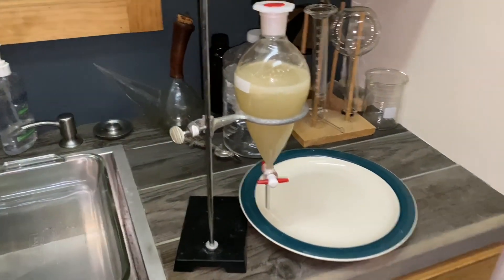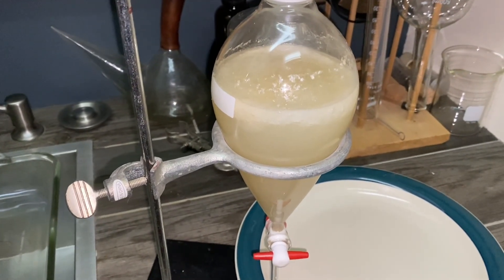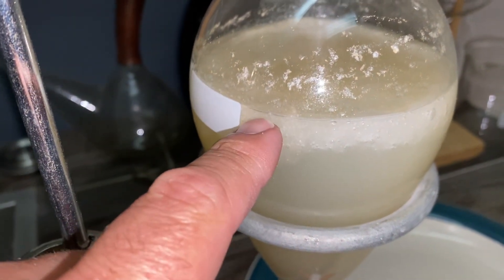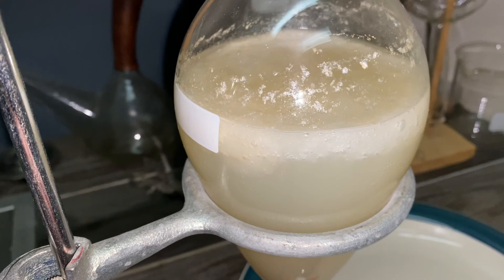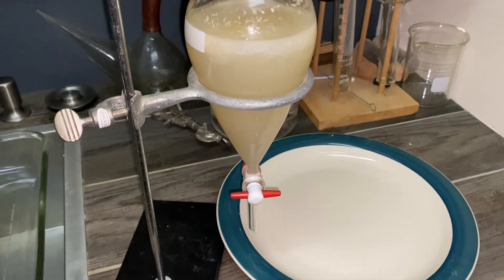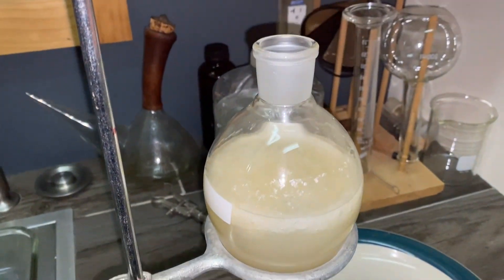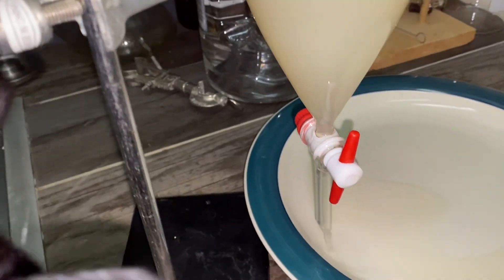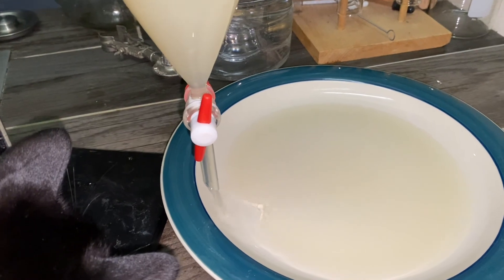So here we are three days later. I had it in the refrigerator for about five hours and then we needed room, so I put it in the closet. You can see that it's separated into two layers — a lot of your plant waxes and the CBG. Any water-soluble substances are going to go down here and the oils and waxes are going to float to the top. So we're going to separate this and then let it dry out. With your separatory funnel, you want to take the top off so that it doesn't have any vacuum chugging.